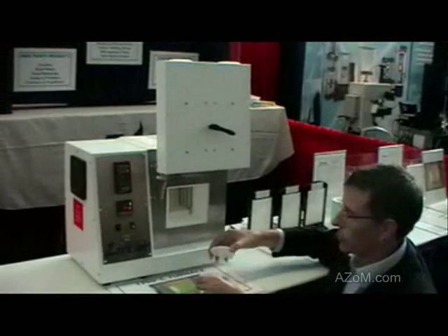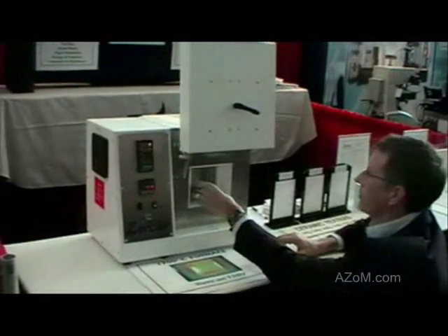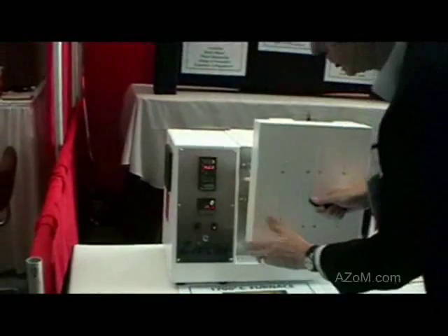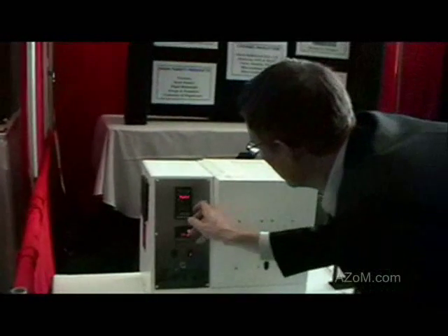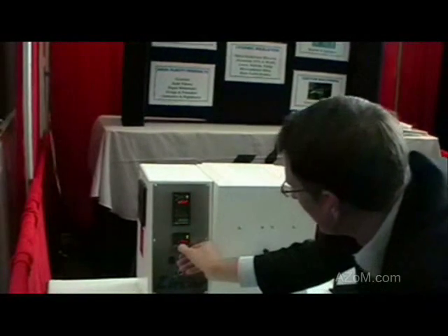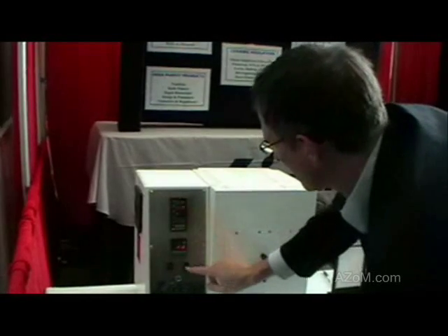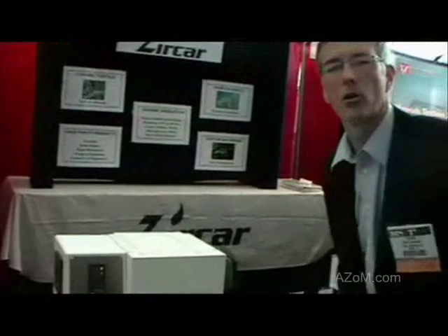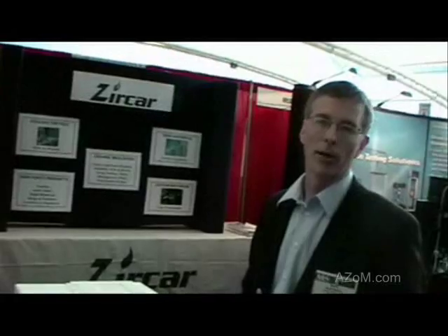What we have here is a dense tray with zirconia beads that you can load your product into. You load that into the furnace, center it, close the door by releasing the latch, and then you simply reset the top, reset the bottom, press run, and turn on the heat. This will allow you to go to 1700°C in less than one hour if necessary, and it's fully programmable.